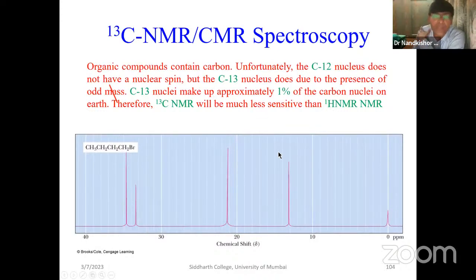So I think today we will stop over here, and tomorrow we'll talk about the CMR and mass spectrum, and thereafter tomorrow we will take the exact spectra for the analysis.